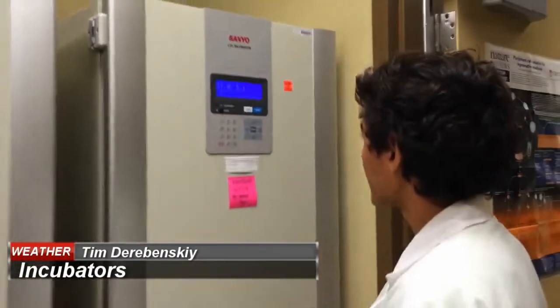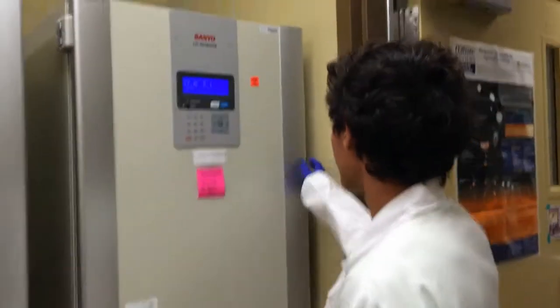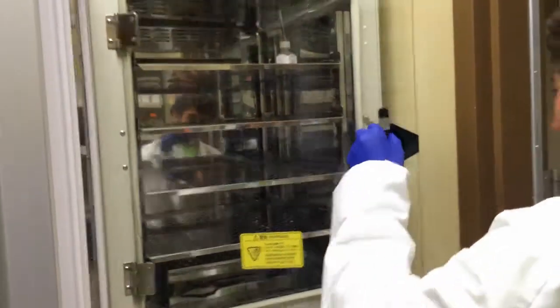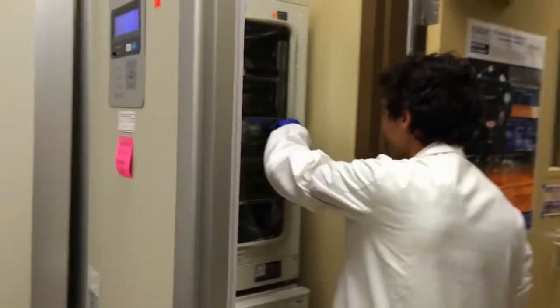Thank you. It's your boy Tim, PhD Weatherman, doing what the weatherman does. Let's check some temperatures. This is 37 degrees. Mimics the human body. Perfect condition for cell growth. Let's look inside. Looks good. Check the humidity. Ooh, it's humid. It's good. Perfect day to take out your kids for a walk.